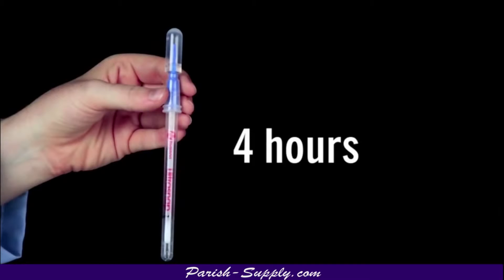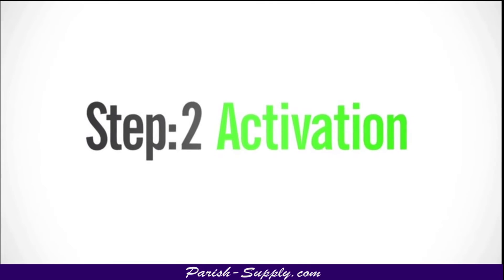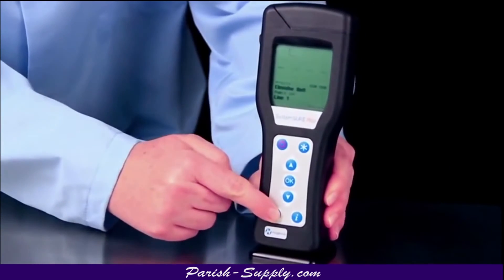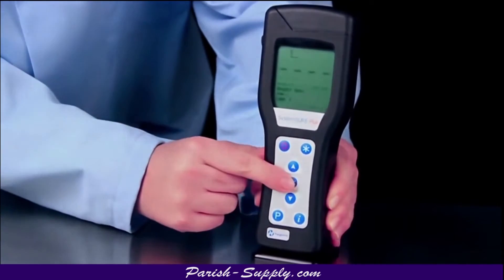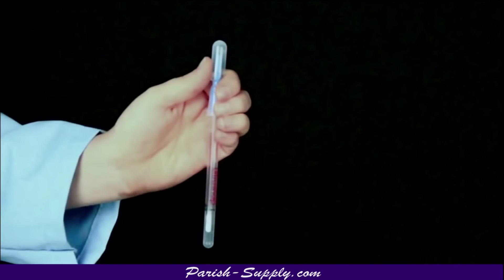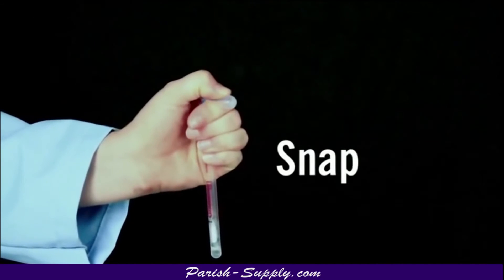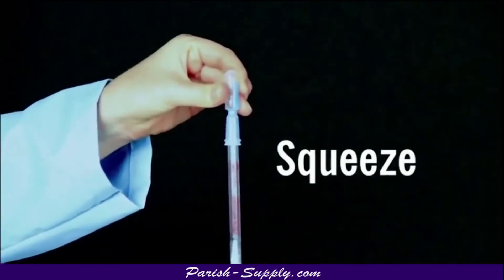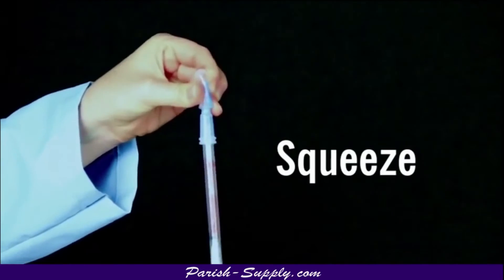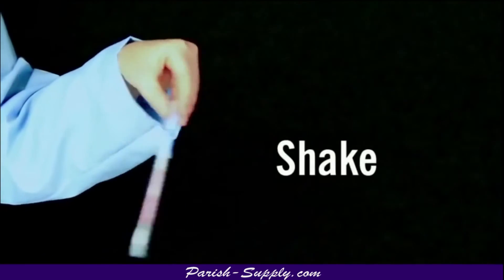Ultrasnap may remain unactivated in this state for up to four hours. The second step is activation. Turn on the luminometer. If you've programmed locations, select the location to be tested. The easiest way to activate Ultrasnap is to hold the device in your fist and use the thumb and forefinger to break the snap valve by bending the bulb forward and backward. Next, squeeze the bulb twice to expel liquid into the tube. Then shake for five seconds.